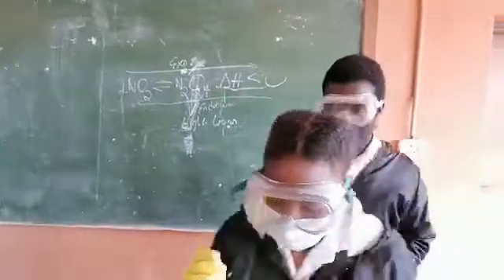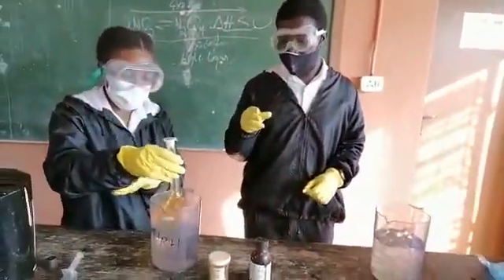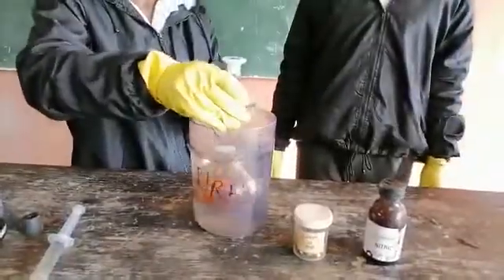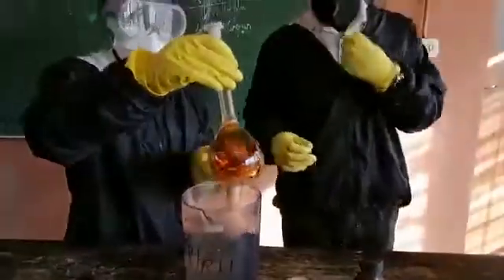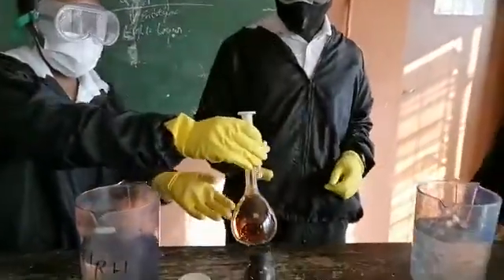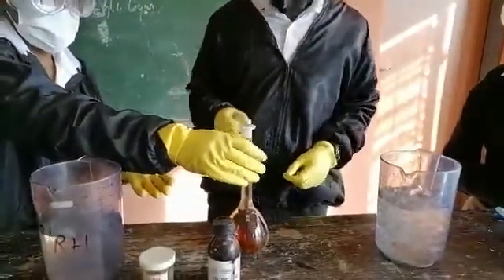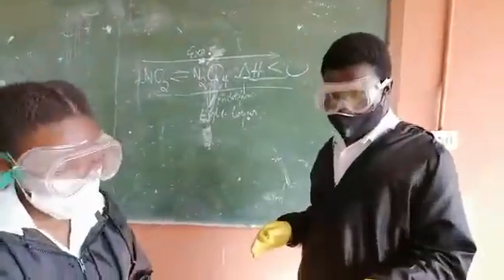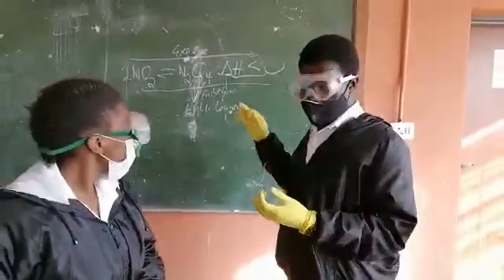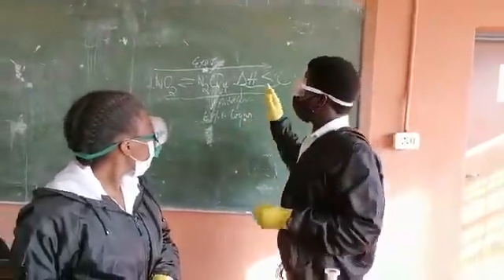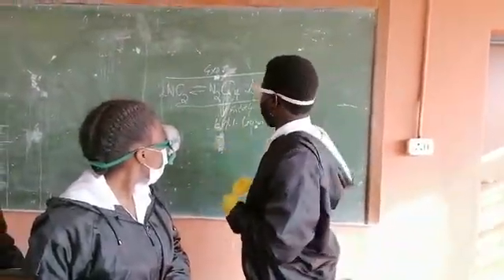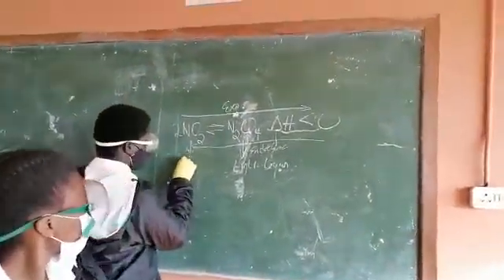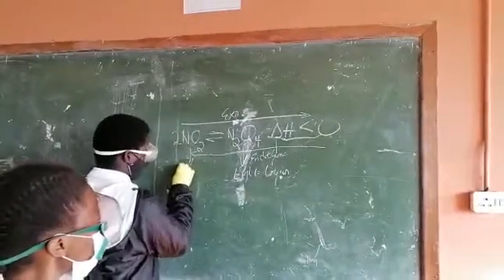Now for our second observation, we are going to be putting the flask in the hot water bath. Now we observe the dark brown color, which means that the endothermic reaction was favored. Since temperature increased, it shifts equilibrium to the left, which means that the reverse reaction was favored. So the concentration of nitrogen dioxide increased, which means that nitrogen dioxide is dark brown.